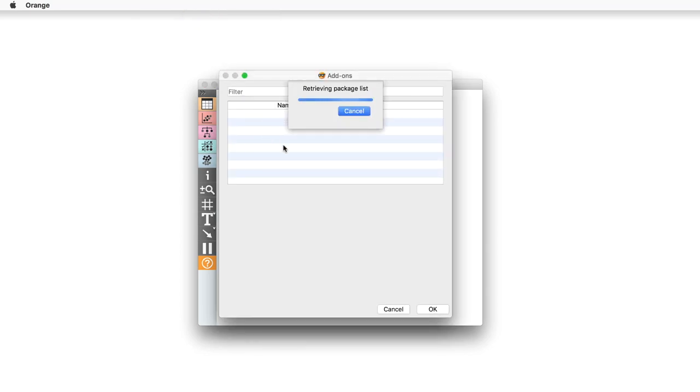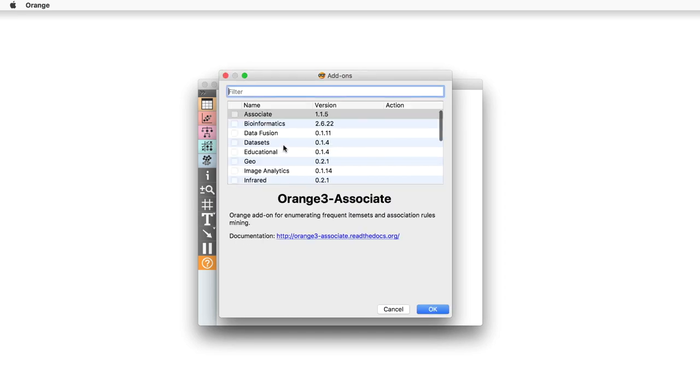Then, install Spectroscopy Toolbox. Simply go to Options, Add-ons menu and look for Spectroscopy Package.